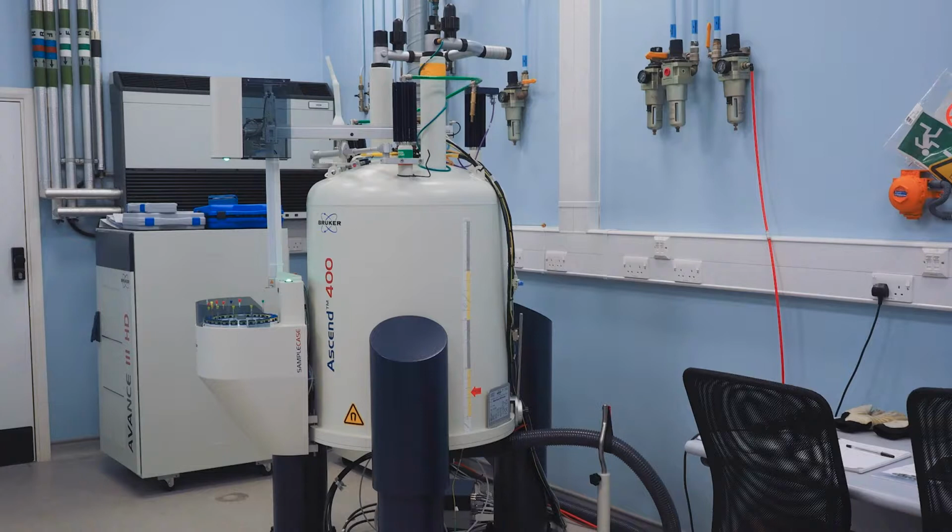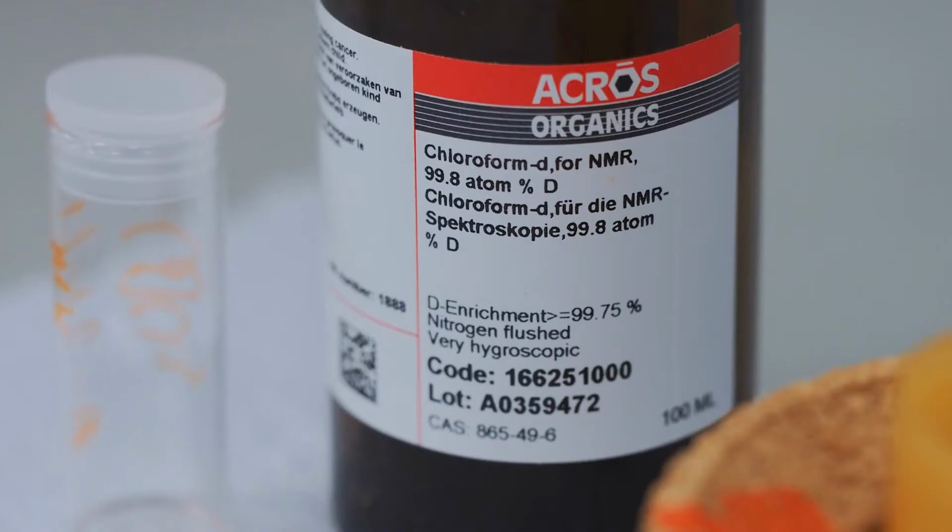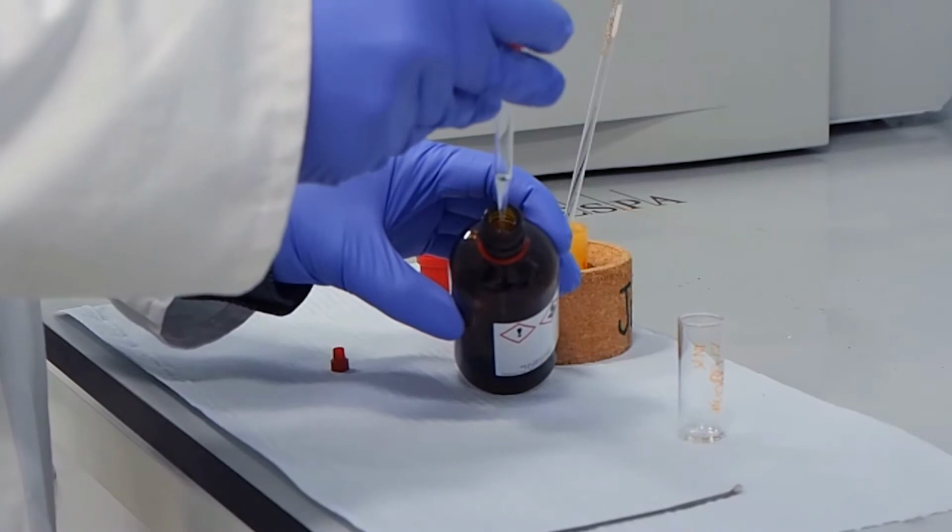Okay, so what we're going to do tonight is run through some specific NMR spectra. Myself and Matt Kershaw, one of the NMR technicians, went into the lab and recorded the NMR spectra for you. We made a little video while producing those spectra, which I'd like to run through now to show you how we did this. Here we have the NMR spectrometer, newly refurbished here in Milton Keynes. Matt was adding deuterated chloroform, a deuterated solvent, to a sample of ethyl benzene.